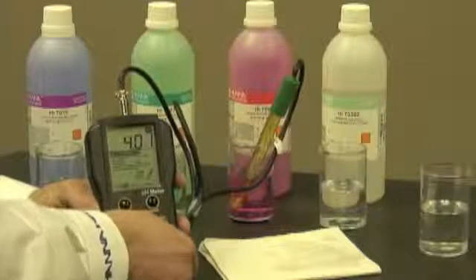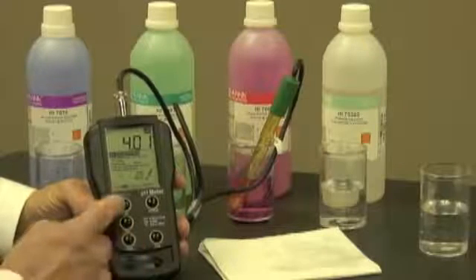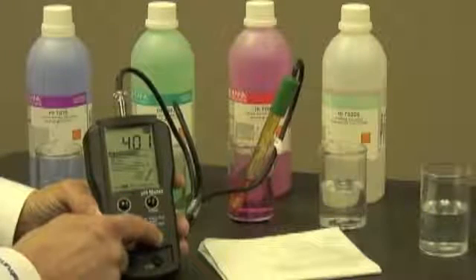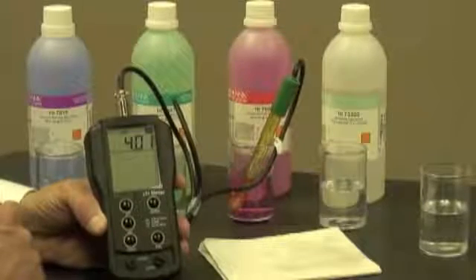Very easy to do. Now I'm at 4.01. I simply push the CAL button and my meter is ready to use.